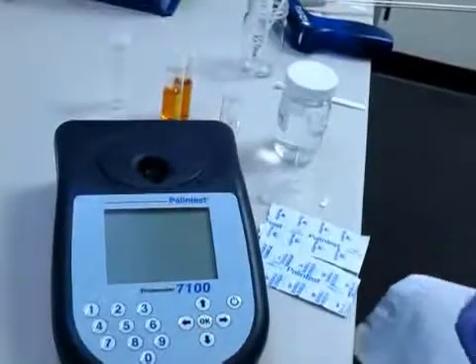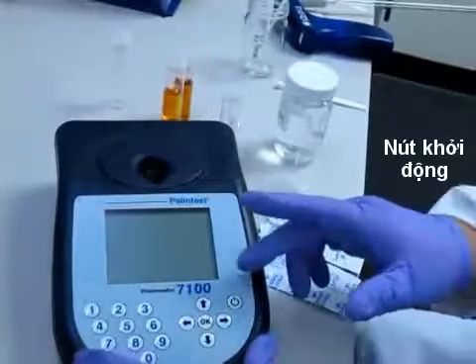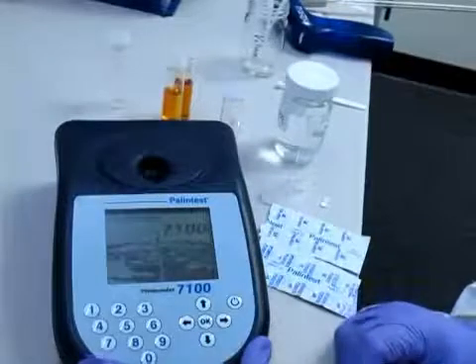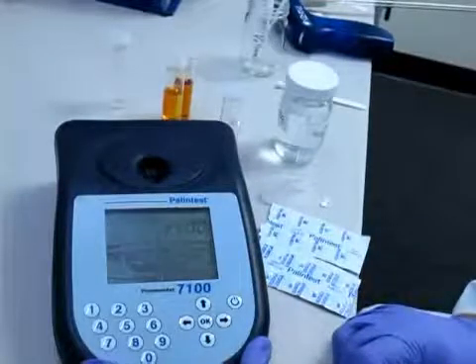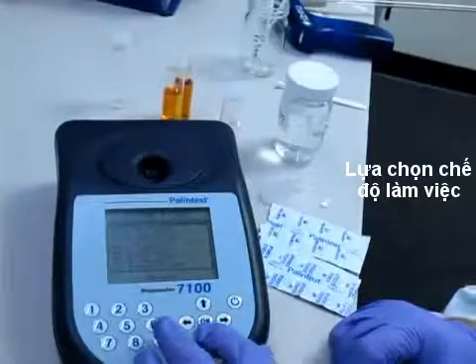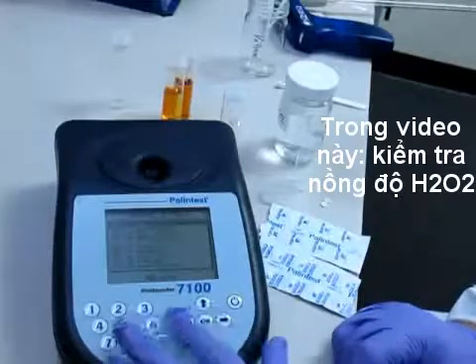This is a short tutorial on the Palintest Photometer 7100. The on-off switch is here, press that button to operate. Then choose a test from the drop-down menu. I'm going to choose the hydrogen peroxide 100, so it'll read zero to 100.